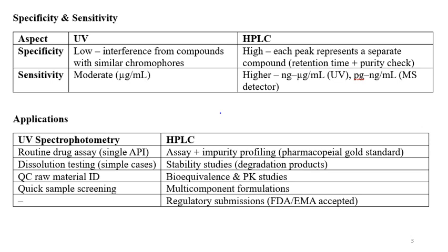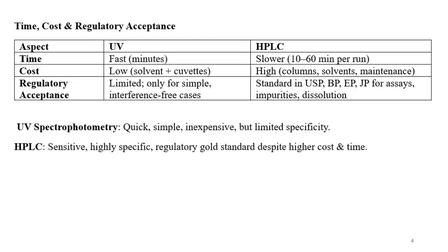Generally, nowadays HPLC is more widely used than UV for regulatory submissions to authorities like FDA, EMA, Brazil's ANVISA, and many more.